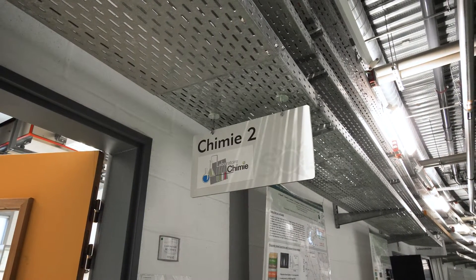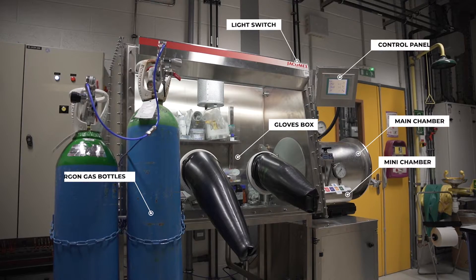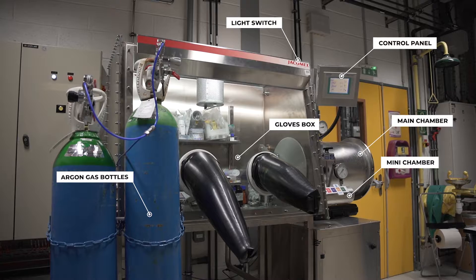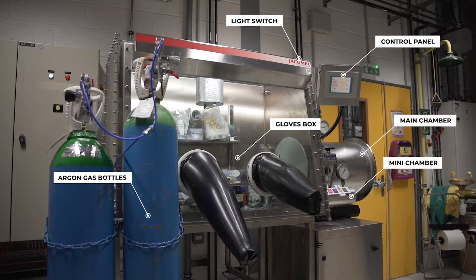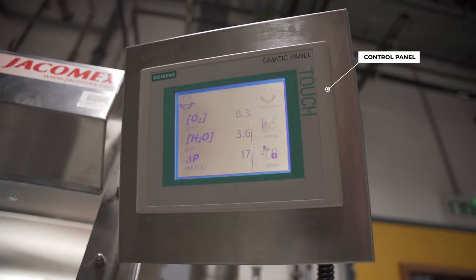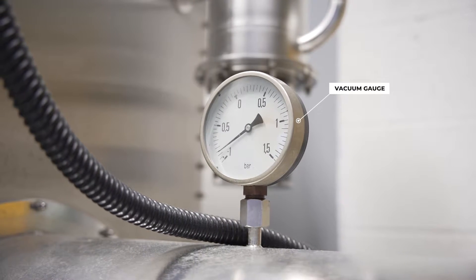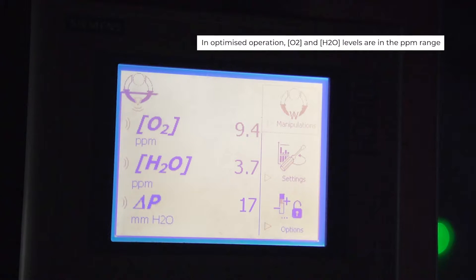The glove box is located in Chemistry Laboratory 2. A glove box is a hermetic compartment with a controlled atmosphere that protects sensitive samples from humidity and oxygen. It allows you to work in overpressure. It consists of an integrated neutral gas purification system, which ensures closed-circuit purification of the gas atmosphere — argon — by eliminating oxygen and residual humidity.